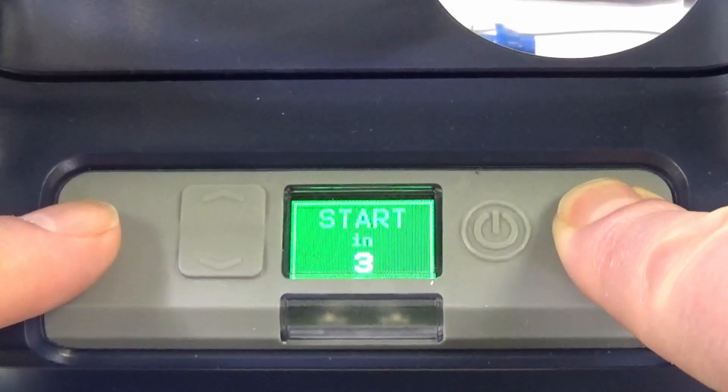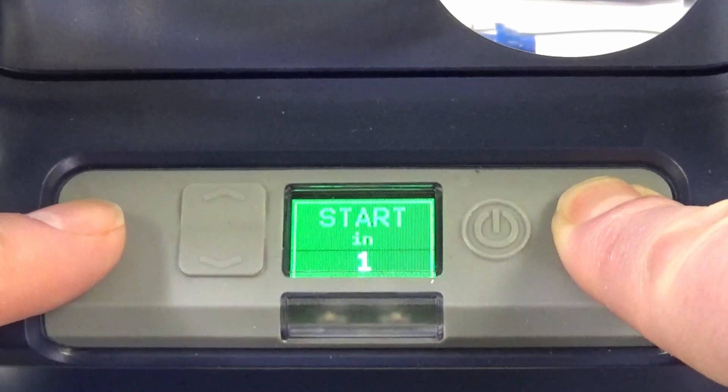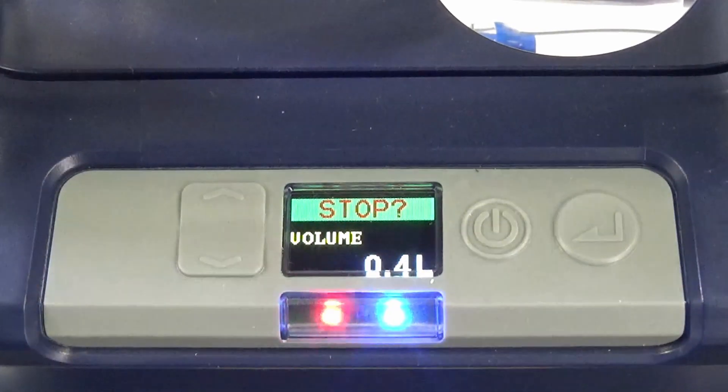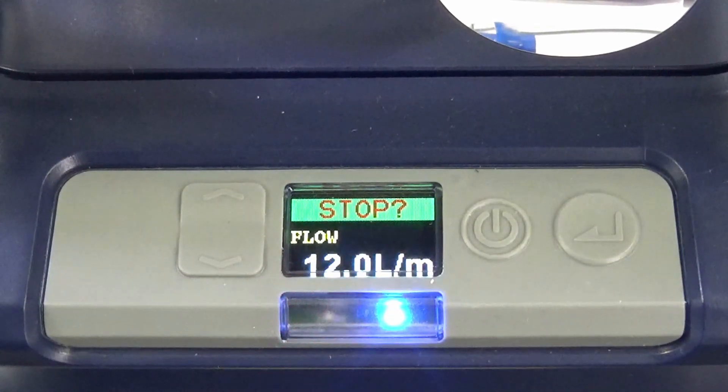Once the pump has been removed from the rotameter, hold the enter key down to start the pump. It will then perform a countdown of 3 seconds and the pump will start running.